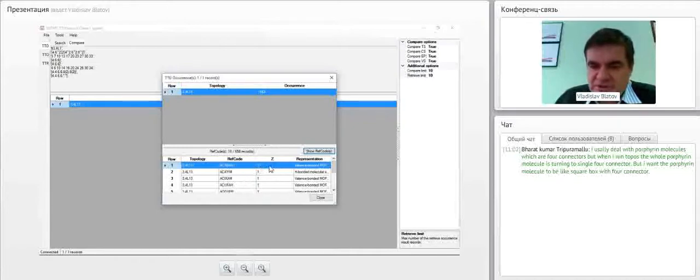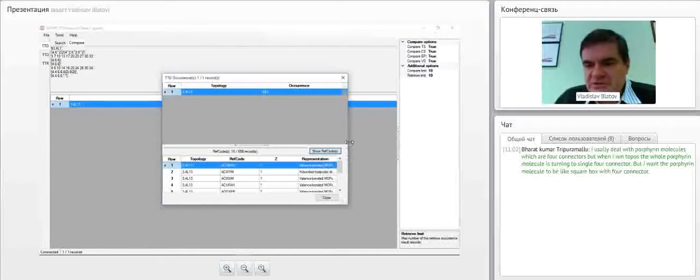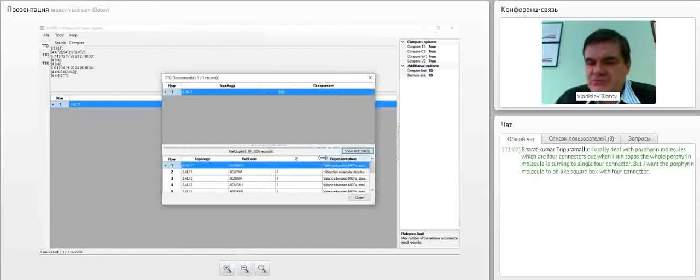I can spread a bit this column. So you see that, for example, for this structure, we have valence-bounded MOF standard representation. What does it mean? This means that this topology occurs in some metal organic framework or in general in coordination polymer that is valence-bounded, and this is standard representation of this polymer.